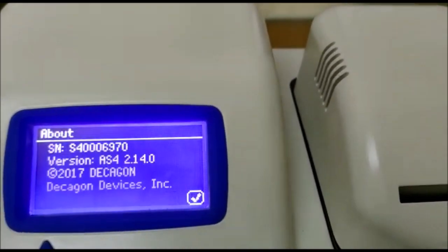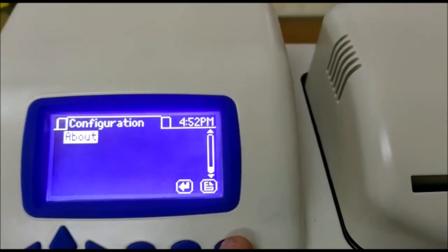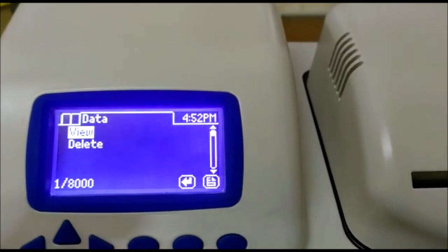This is about the instrument, the serial number and company details. Now, after configuration, we have the data.